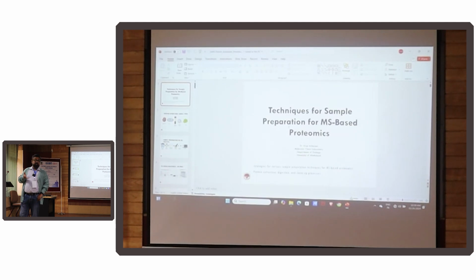So sometimes you need to have some level of automation. Sometimes you can do without it if you have fewer samples. So you see, the fewer the samples, the more human interference. The moment the sample number goes beyond a specific set, maybe you have to process 100 samples a day, that is not humanly possible. It would be humanly possible if 10 people started working together, but that will add individual variation, experimental variation to the data. In the long run, it's very difficult to work with data that has so much interference just because 50-60 people process the samples together. That's one of the challenges. Anyone else?